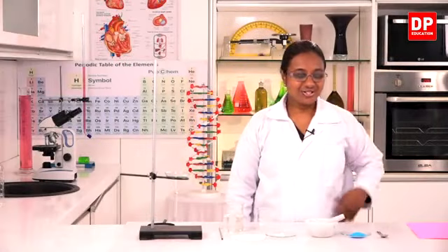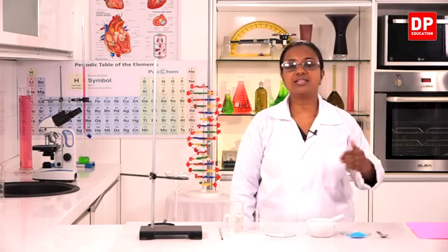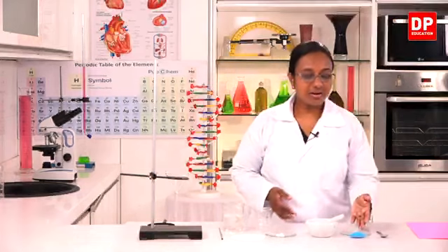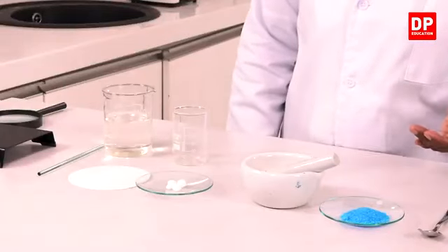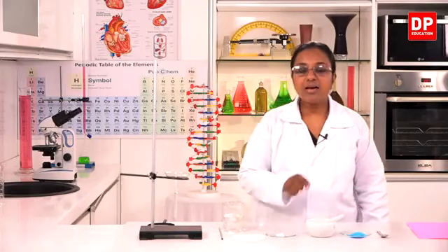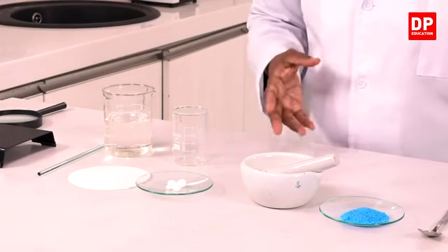Okay, students. So we are going to do the activity to show that pure substances can mix and form mixtures. For that, we need these materials. I have hydrated copper sulfate here. You can see the crystalline shape and the blue color nature of the hydrated copper sulfate. Then we have the naphthalene balls here and the mortar and pestle to grind the naphthalene into powder.